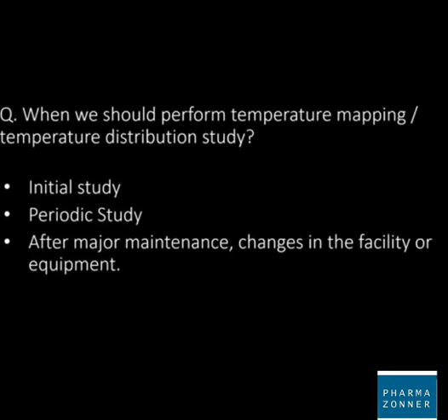When should we perform temperature mapping or temperature distribution study? There are three frequencies at which we should perform it. First is initial study. This is to be done at the time of new facility creation or new equipment installation. Second frequency is periodic study. This is done every 2 years or 3 years based on the plant specific SOP and risk assessment. Third frequency is after major maintenance work or changes in the facility or equipment.